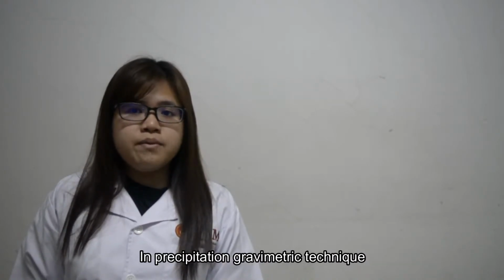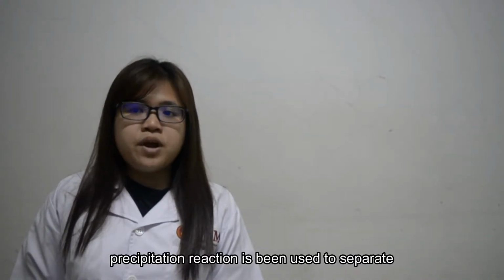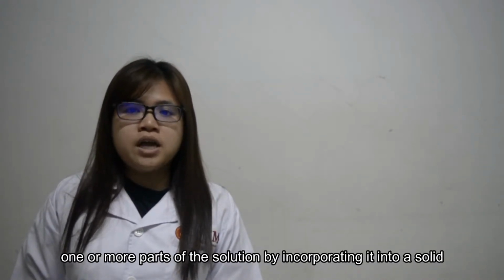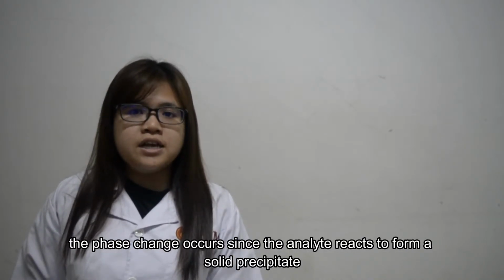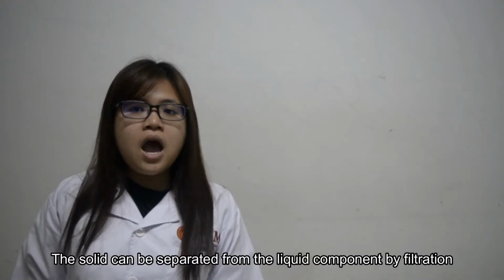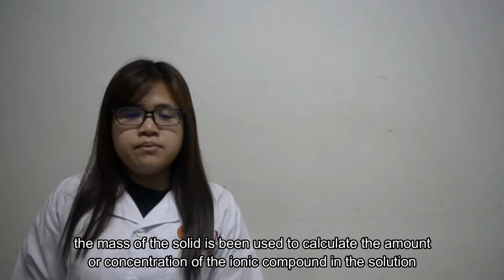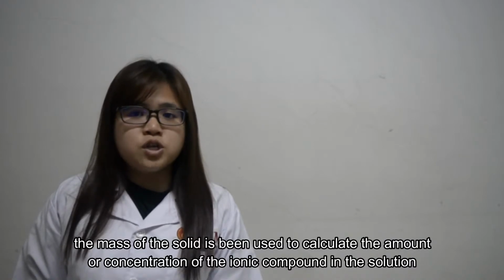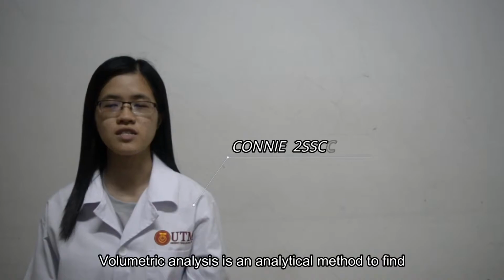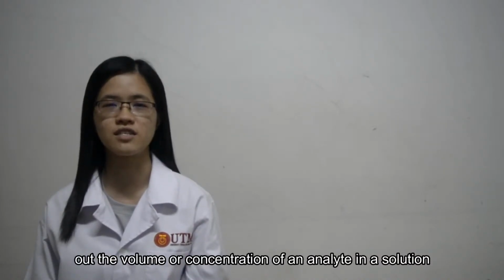In the precipitation gravimetry technique, a precipitation reaction is used to separate one or more parts of a solution by incorporating it into a solid. The phase change occurs since the analyte reacts to form a solid precipitate. The solid can be separated from the liquid component by filtration. The mass of the solid is used to calculate the amount or concentration of the ionic compound in the solution.